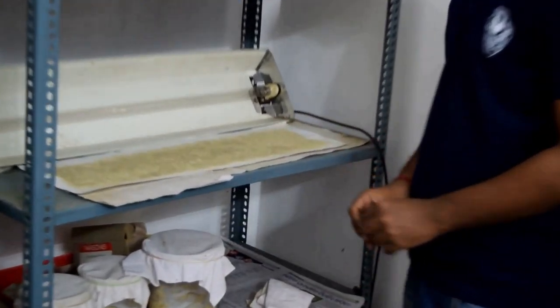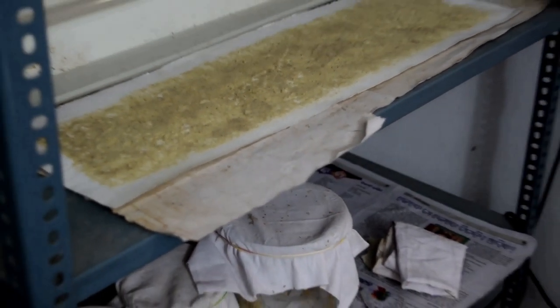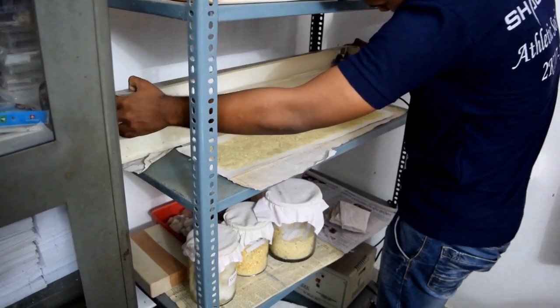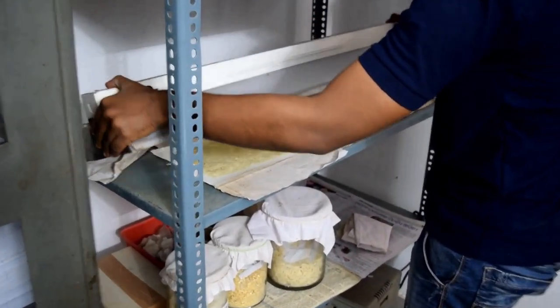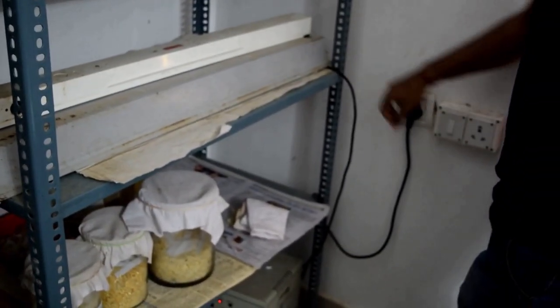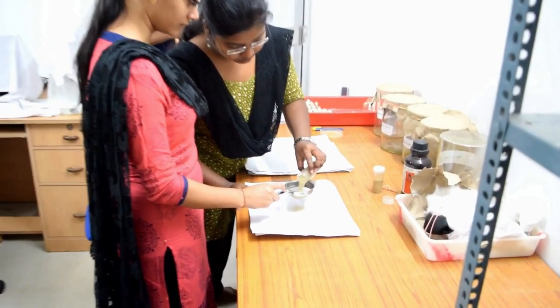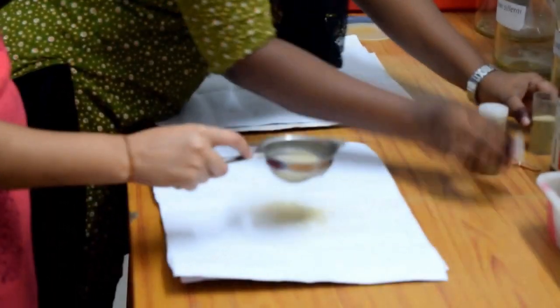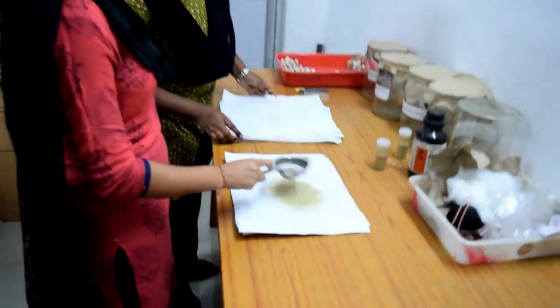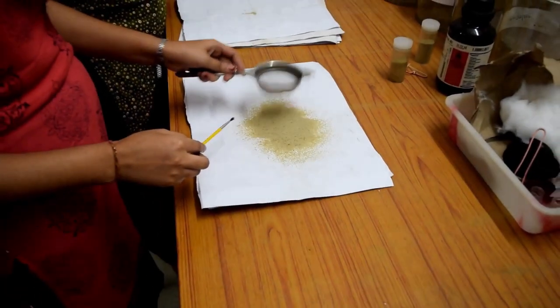The rice moth eggs are treated with 30 watt UV light for 1 hour to kill the embryos. The eggs are strained through tea strainer to break the lumps. The eggs are winnowed to eliminate broken body parts.